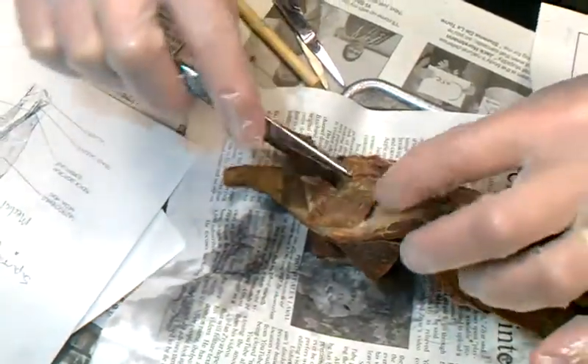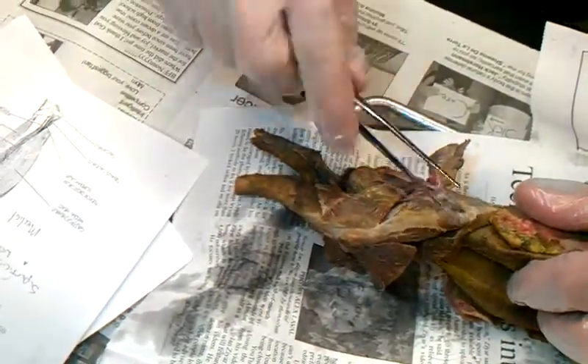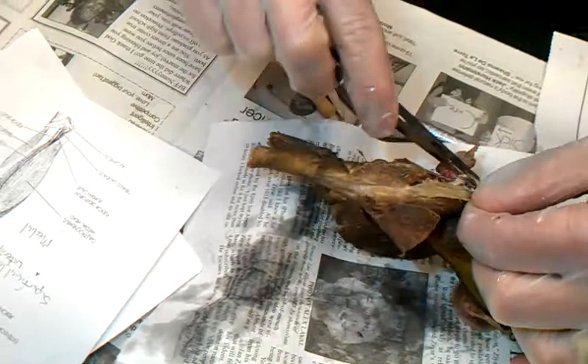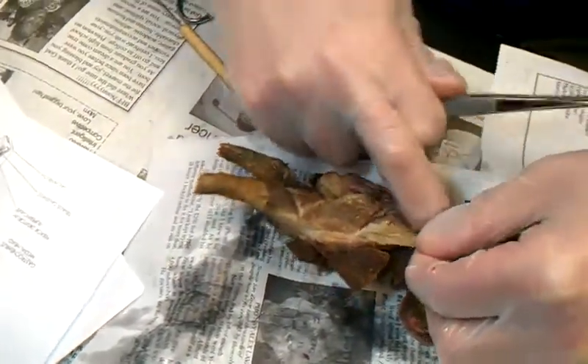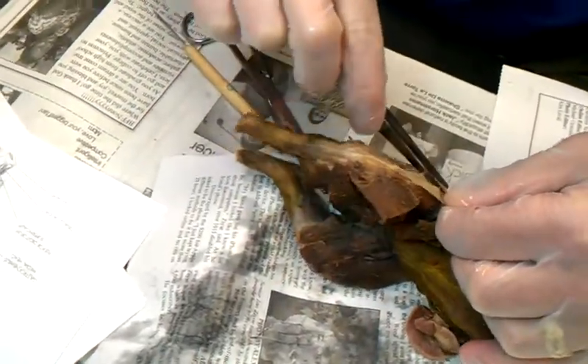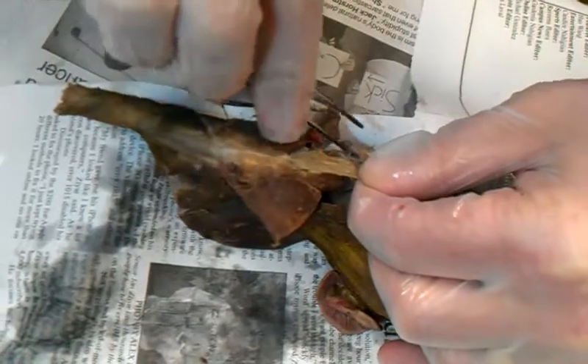So once you've moved that out of the way and you've got the tensor fasciae latae out of the way for the most part — did you guys get in there? Almost in there. So I'm just going to force my way in there again. And so you need the glute. The outer glute is called the what? Gluteus maximus.